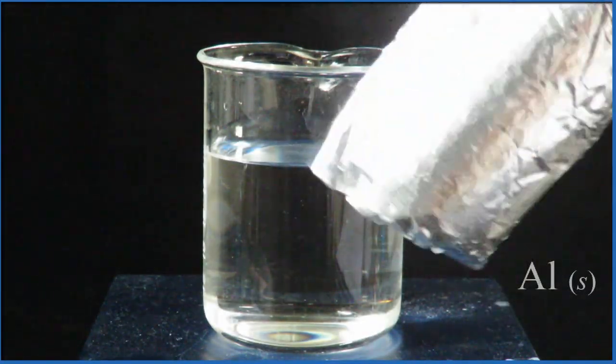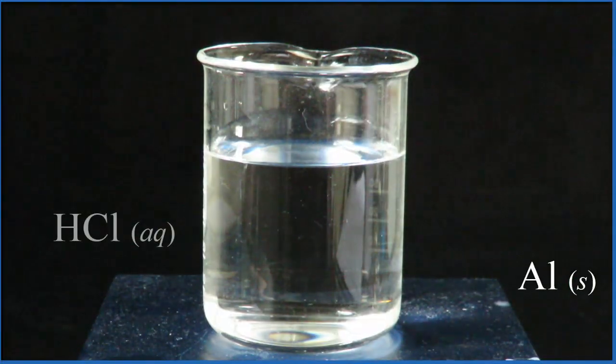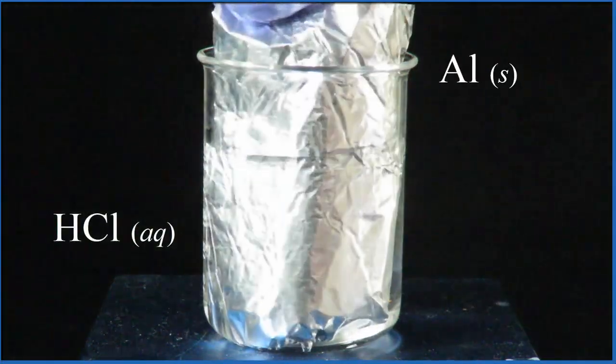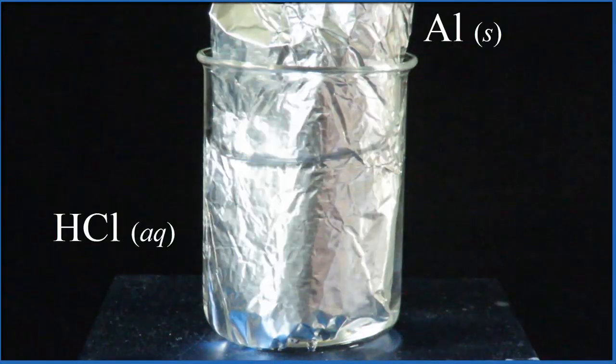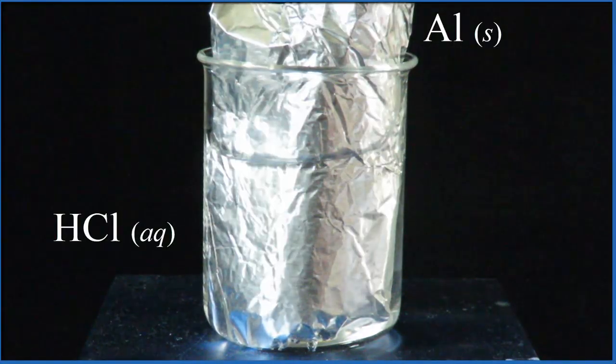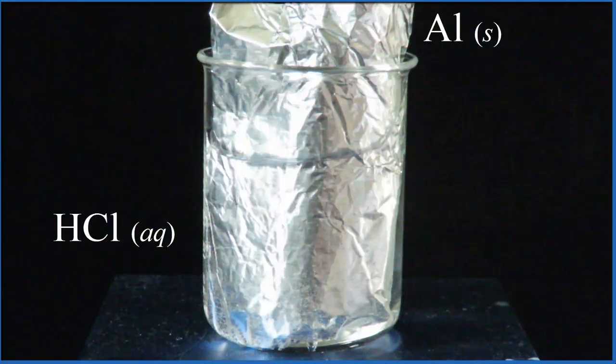Let's put some aluminum in hydrochloric acid - concentrated hydrochloric acid. We have aluminum foil, which is solid aluminum, and then we have hydrochloric acid which is concentrated but aqueous because there's still some water in it.